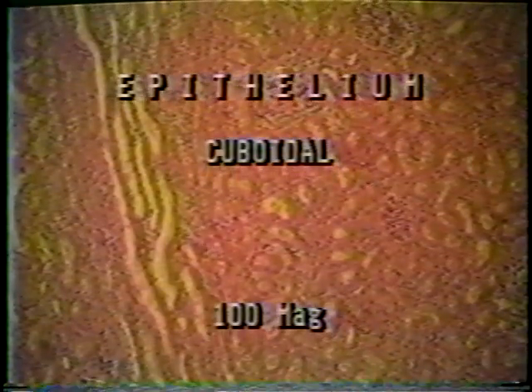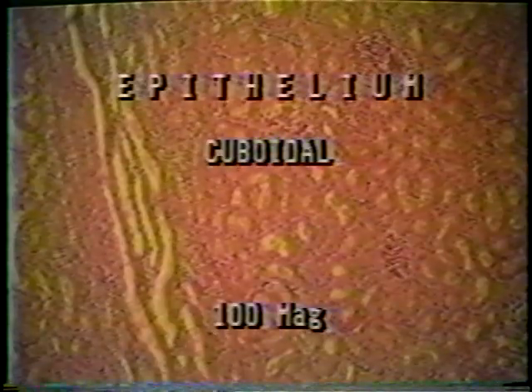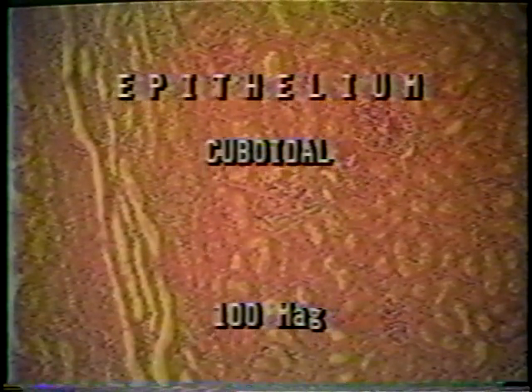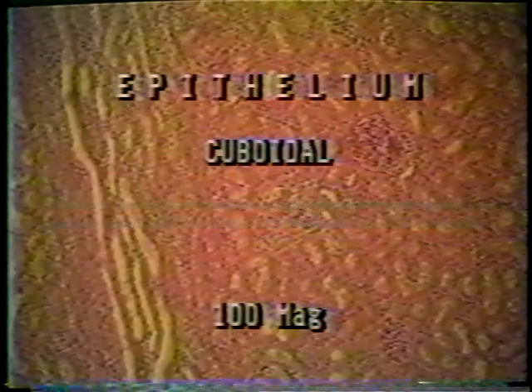Perhaps the most difficult epithelium to see and understand is cuboidal epithelium. To most people, the cells do not look square, and in some examples it doesn't seem to have a free border. This example is of the kidney. The kidney is actually an organ of thousands of tiny tubes.